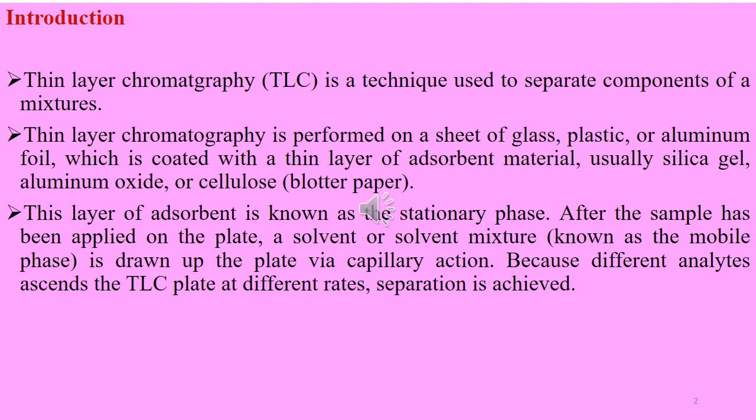Now we will discuss thin layer chromatography in detail. Today we are going to discuss thin layer chromatography, which is also known as TLC. It is a technique which is used to separate components of a mixture.